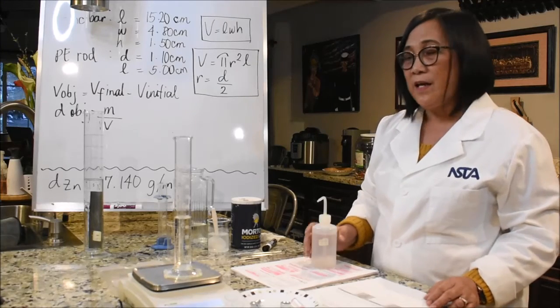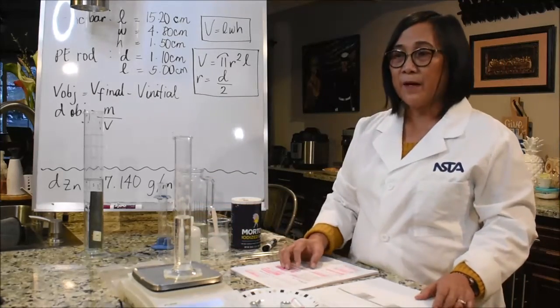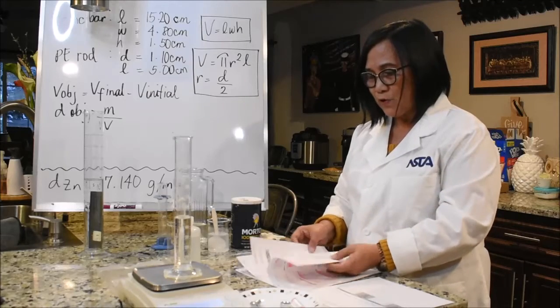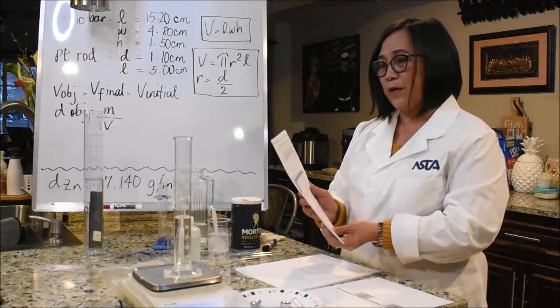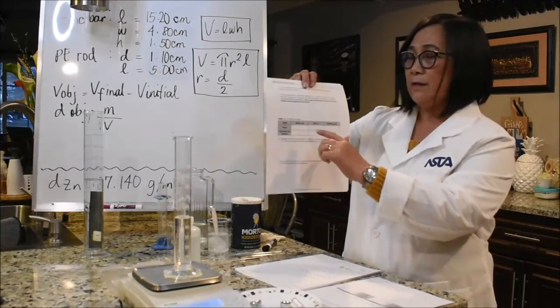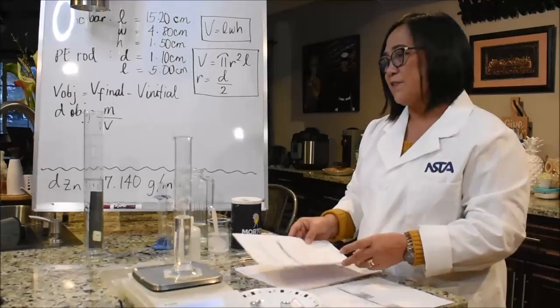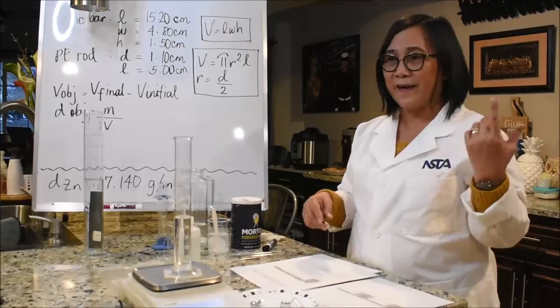Again, the combined mass of the cylinder and the water is 181.4 grams. Now you will calculate what is the mass of 50 ml of water, and once you find that mass by subtraction, you will fill out data table 2.3 and consequently calculate the density of tap water. This is water from the tap, so it is water delivered to our home by NTUA.